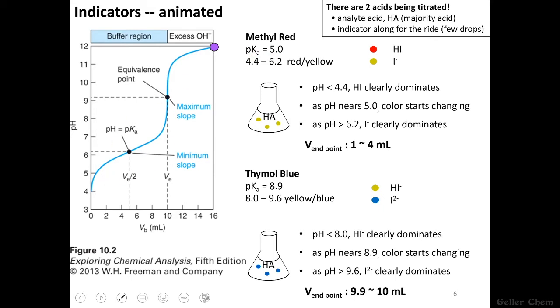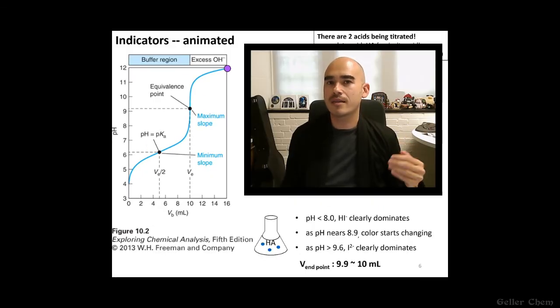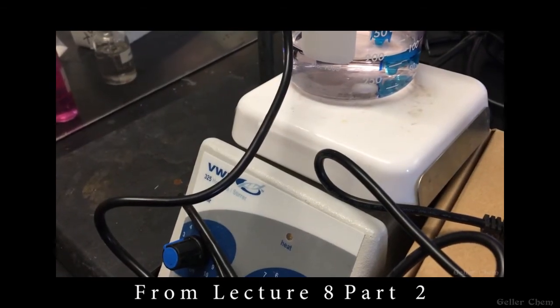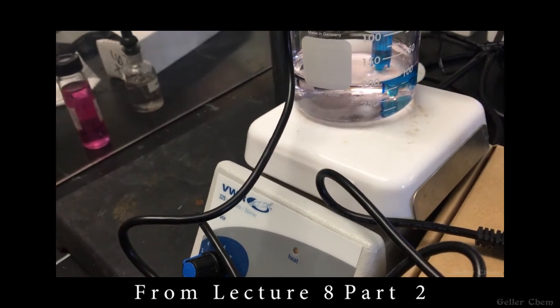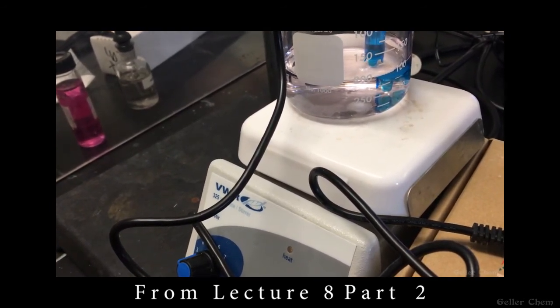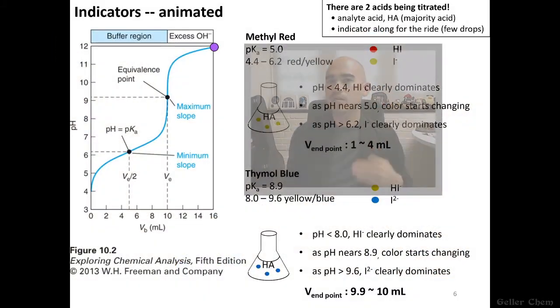So that's why I said they should happen at the same time, but they're not guaranteed to happen at the same time. And I want to stress that if you have an appropriate indicator, it only takes 1 or 2 drops of titrant to cause the color change to happen, just like what we saw in that titration video I showed before. We can see that the solution has actually turned color. It is hard to see with the camera, but hopefully you can tell that that is no longer clear. It is a faint pink, right?